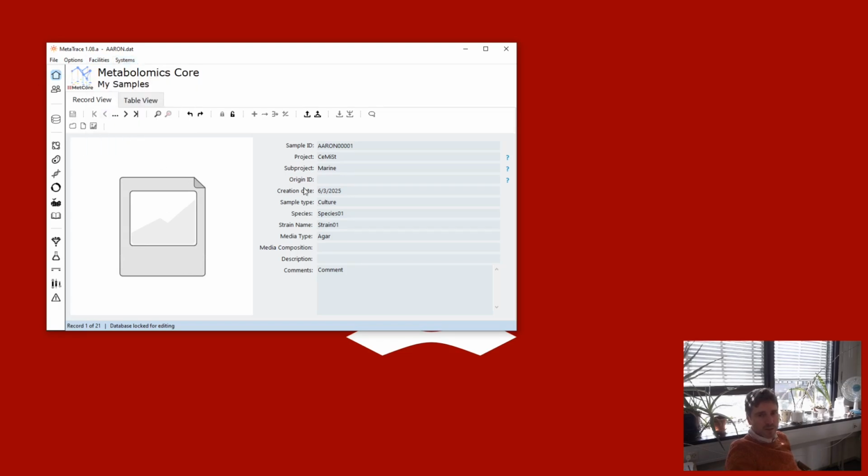This has been an introduction to MetaTrace. There are some other little things that we could go into, but I think maybe we'll just leave it for now.